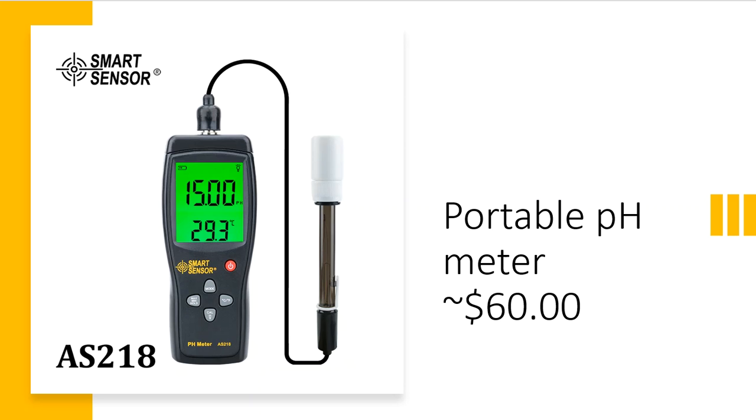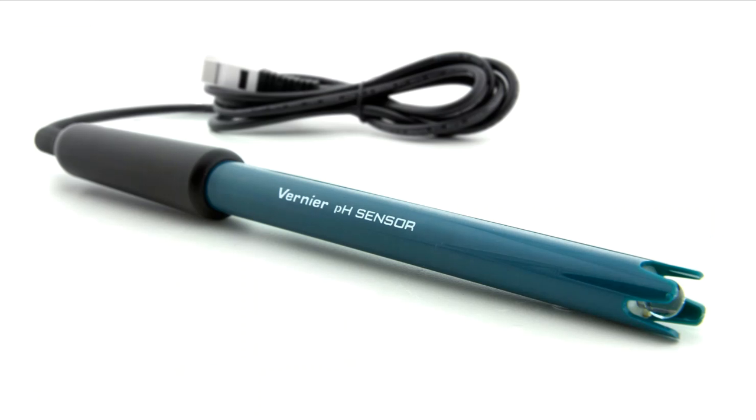So if you do environmental testing and the environmental testing requires you to do the testing or some of the testing at the location, then these are very portable. They're very small. They're not the best pH meters, and that's one of the reasons that they're so darn cheap. It gives you an idea, but by no means is it the best measure of pH that we can do in a lab environment. Something else that we have in our lab are portables, but these are more what I would call the basic side of the house of the portables, and these are the Vernier pH sensors that you will probably be using in this lab.